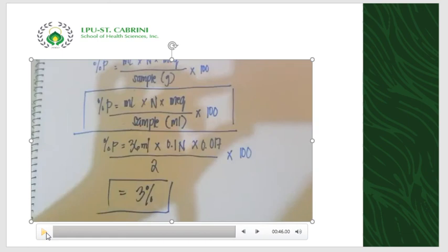Okay? Doon sa pag-assay natin. Ilang percent ba? Kasi, sa hydrogen peroxide, guys, we have different percentages of your agua oxinada. Kung makikita nyo sa mga Mercury Drug or sa mga small boutiques or local boutiques, makikita nyo meron diyang red color or blue color. Okay, so 6% or 3% hydrogen peroxide, it can be used for the wounds. Okay, so iba, then yung iba, is ginagamit na for the medical use.